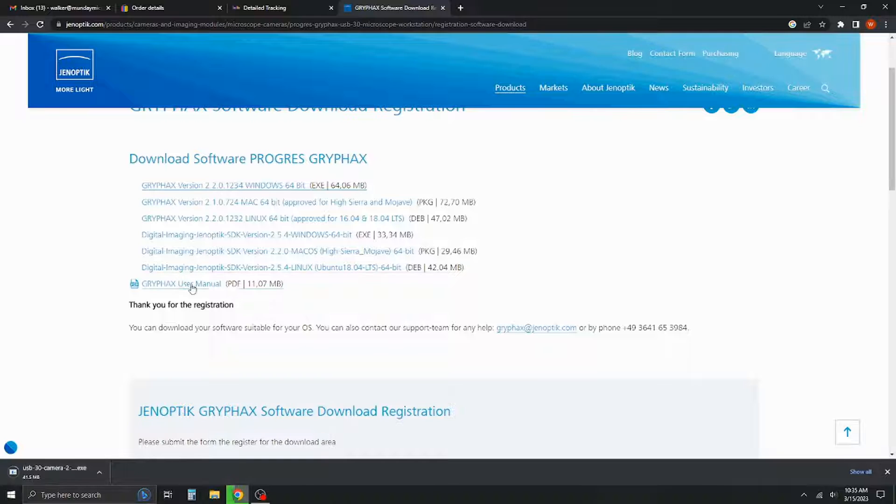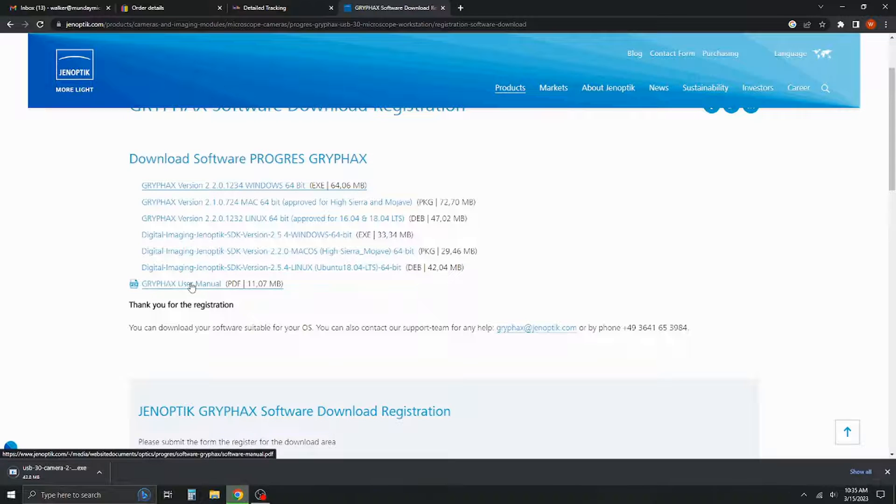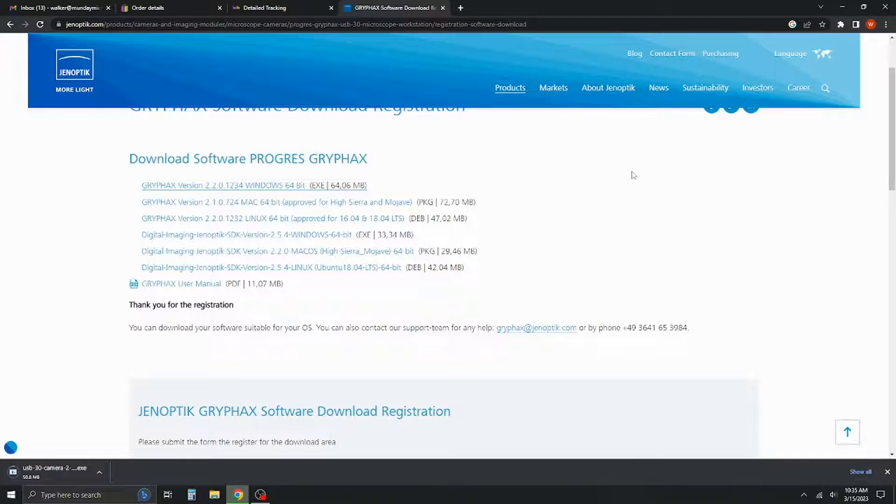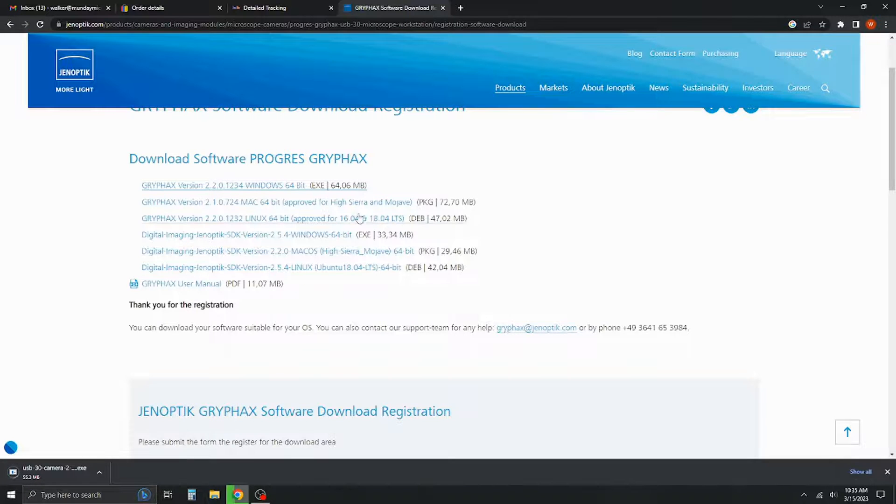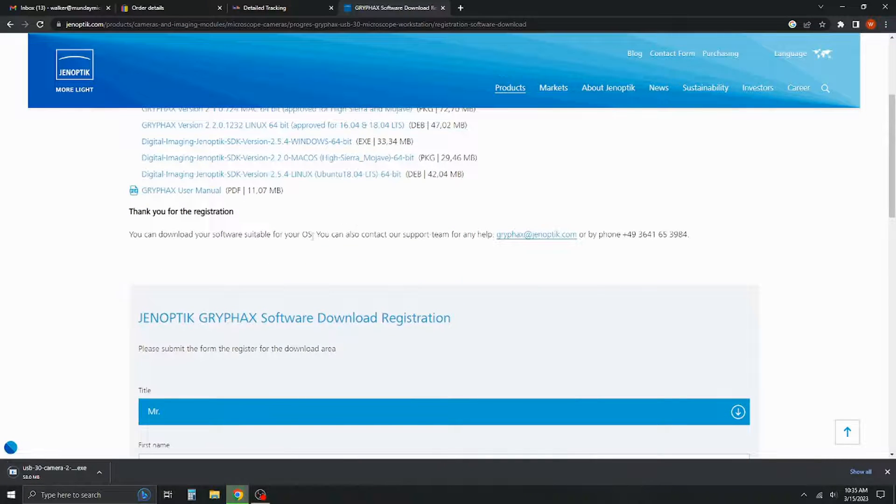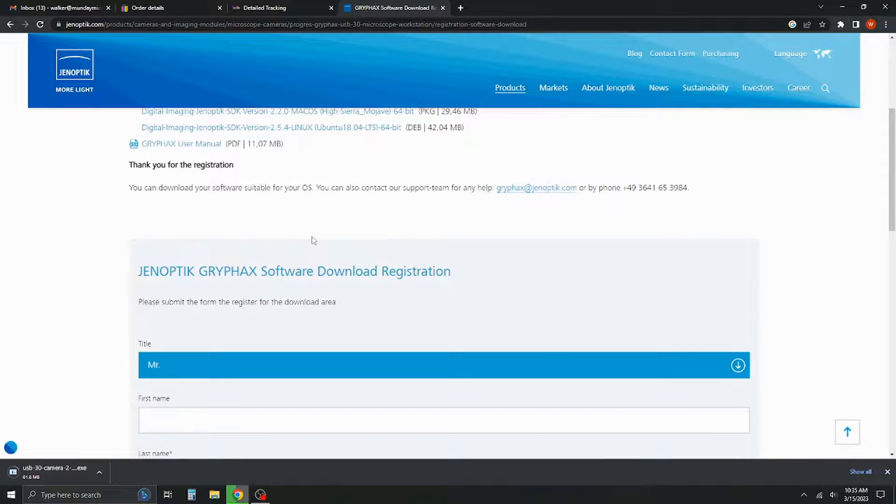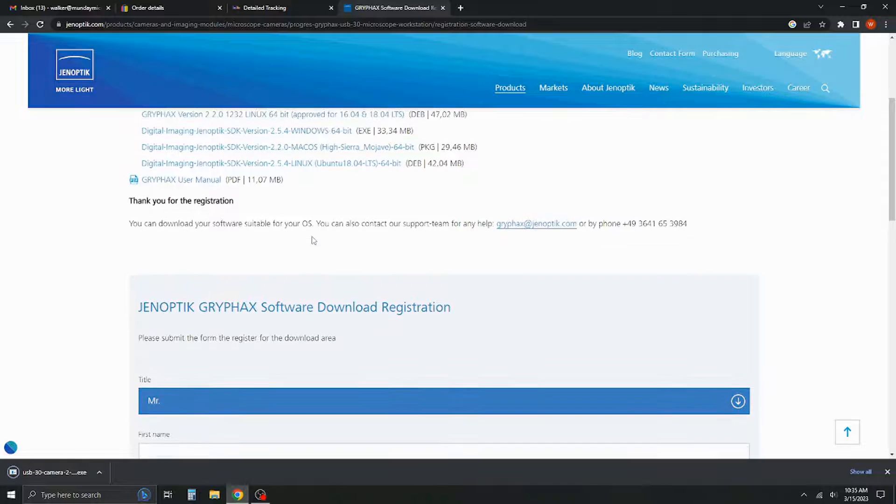And if you'll notice here, we also have a copy of the PDF for the user manual. And their website also does contain links to a lot of their helpful videos and things along those lines.